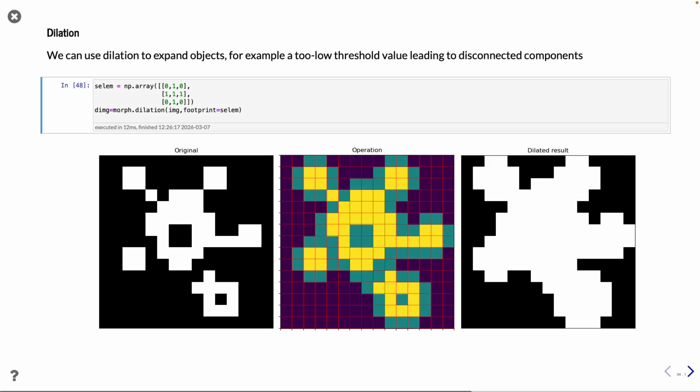So looking into detail, first the dilation. You can see here that if you go to this pixel, the cross has contact with the original structure, then let's make a pixel here, and so on. And that's why it's also growing the whole structure and filling out the holes, and also these gaps between the objects. So you get a very blobby appearance after the dilation.